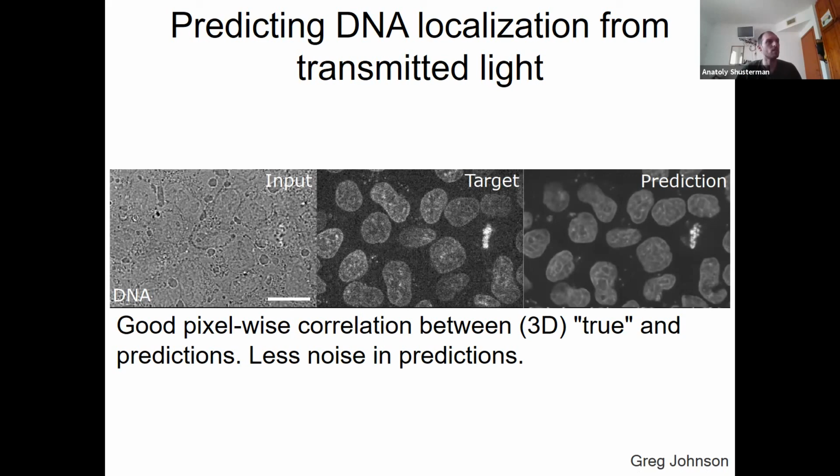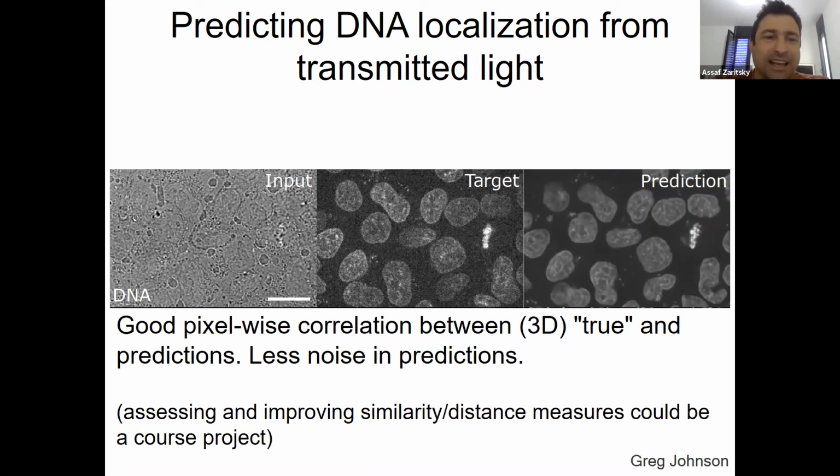Exactly. Think about it. As a model, we're trying to capture structure within our data. Noise has no structure. Most of what we see here in the background is just random background noise, so the network cannot learn that, which actually comes to our advantage because now we can generate nicer images, which are even better for post-processing. And if we talk about similarity measures, we don't really care about correlation between the background pixels and the ground truth. Defining better measurements for similarity based on the tasks you want to achieve could be a good project for this course.